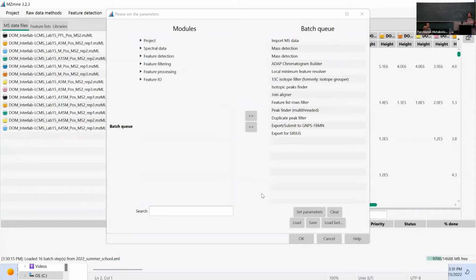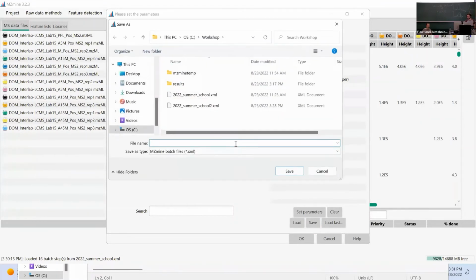It's all run on Orbitrap instruments, some lower end, some higher end, and the resolution is a bit different and so on. But those differences are actually what we want to test with the interlab study, right? We want to see whether they have problems with sensitivity, retention time shift, or the quality of the MS2 data. So who's doing well? And it's interesting to just compare. Is it really the same instrument? So yeah, if you have any doubts there, don't hesitate to ask.